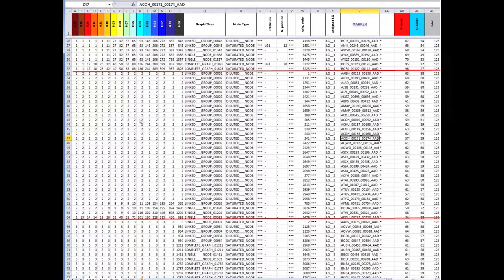So now you've defined groups. You have group 1, group 2, and group 3, and so on at 20%. But if you don't like 20%, you can make that cutoff anywhere you like. If you say, I want to be more stringent this time, I'm going to go at 10%. You have all that information in front of you, and you can decide how you want to make your groups and how you want to break those groups apart.